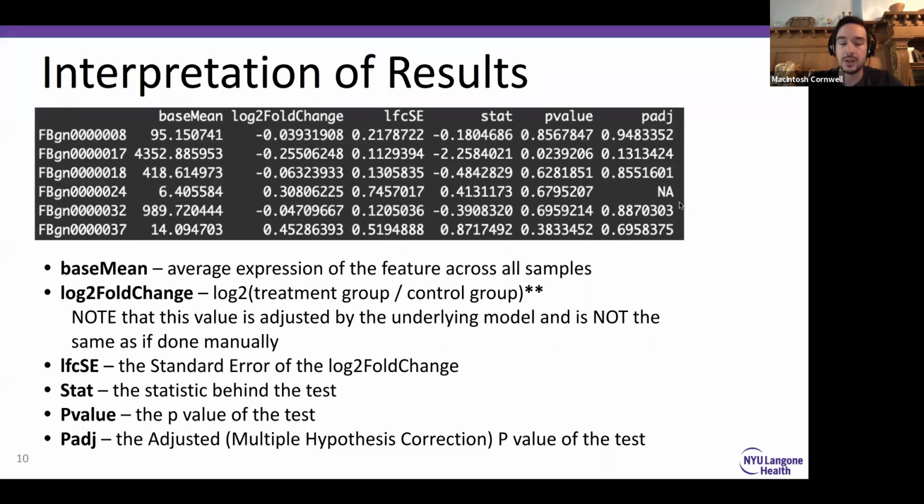It does this because, after assessing the overall distribution of feature counts in your population, the model will set a cutoff where it says, actually, these genes below this level aren't even worth looking at. Because there's so much variation at such a low expression, the results are considered unreliable and it will exclude those features from analysis.